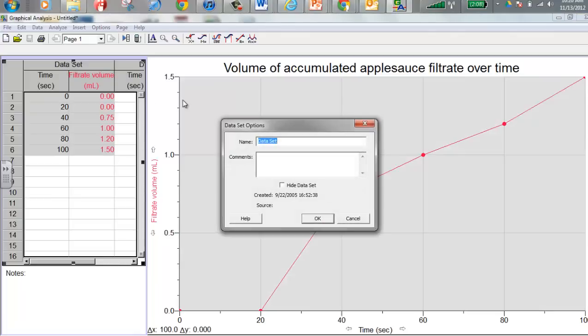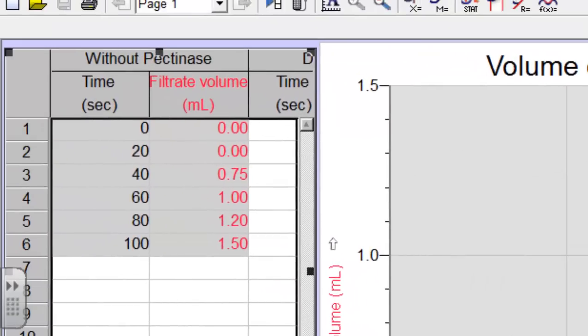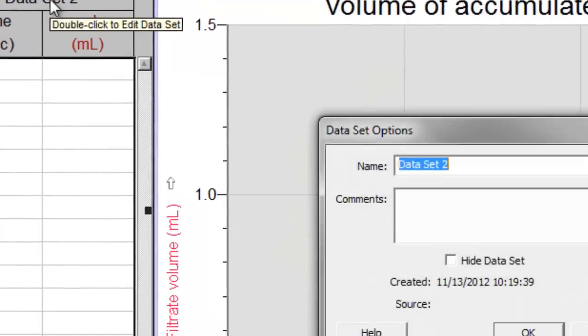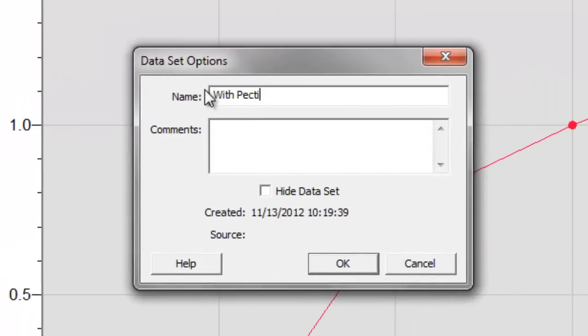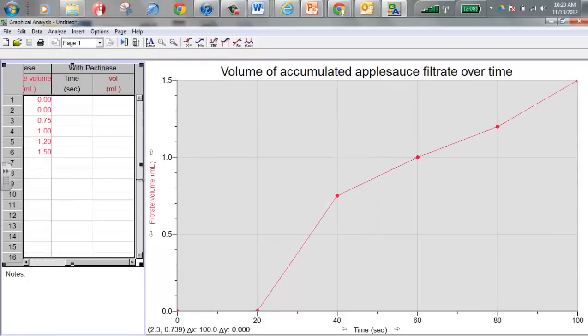It defaults as Data Set and then Data Set Two. It's going to be one graph, two lines on one graph, so I'm going to double click where it says Data Set and this is going to be - this was without the pectinase, just to keep everything straight. And I'm going to double click over here and I'm going to write this will be with the pectinase. I'll start entering time here. I'm going to put in zero and then zero, twenty and you have four at 20 seconds. At 40 seconds you had five, at 60 seconds you had six milliliters, and at 80 seconds you had 7.5 milliliters.